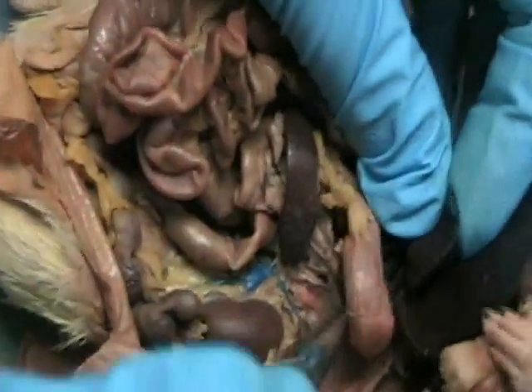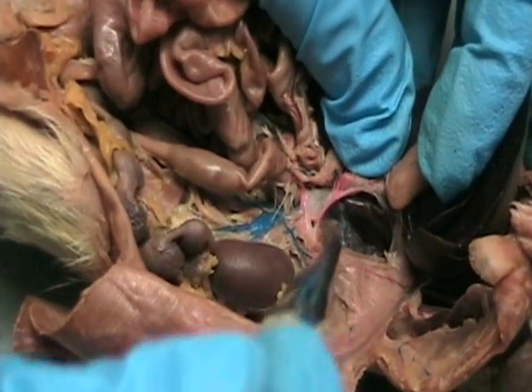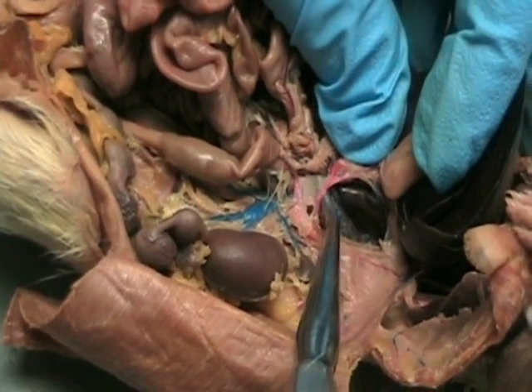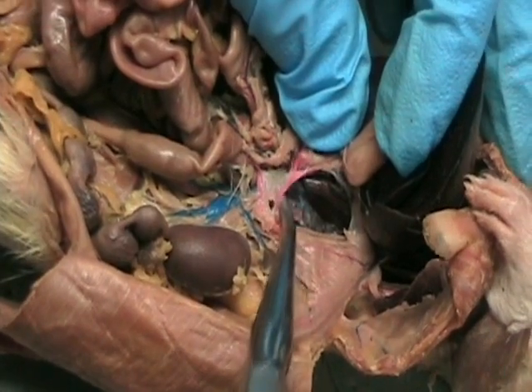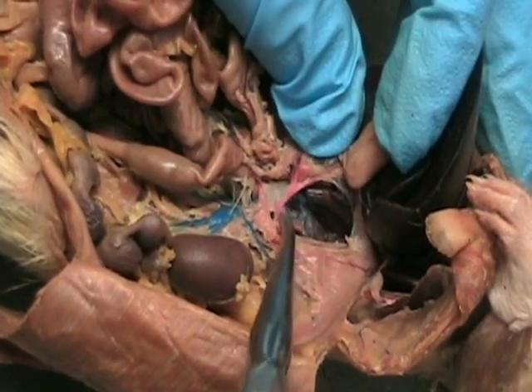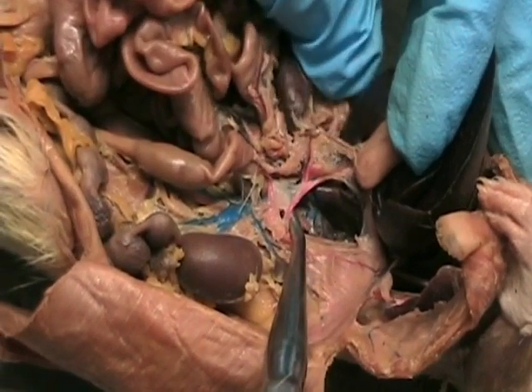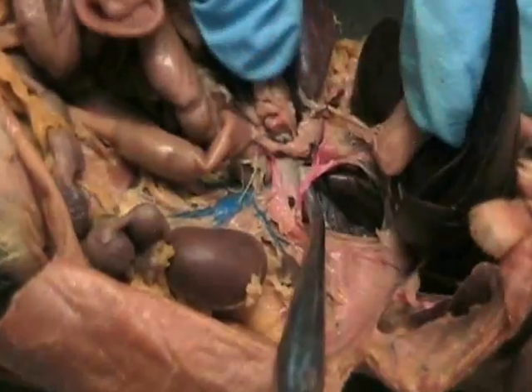The other one we're going to, I don't have a great example in here, but you can see some pink up in here going to the liver. That must be the hepatic artery. But all of those come from this one branch right here. In the fish, we also had the same trunk, right? Or the same starting point. What was that called in the fish? Celiac. So this is again the celiac artery. Okay.